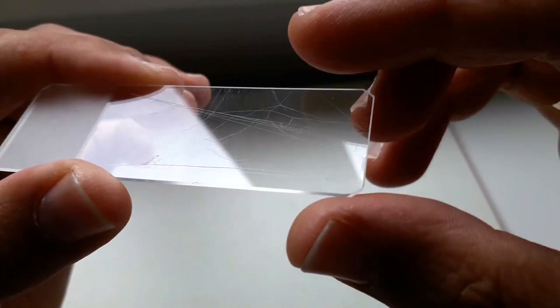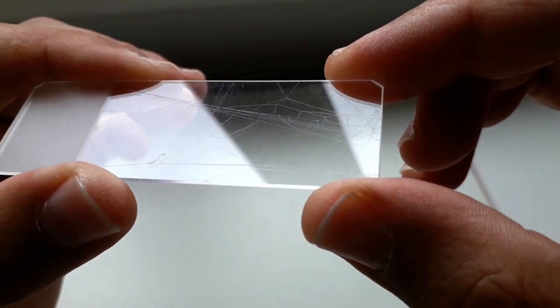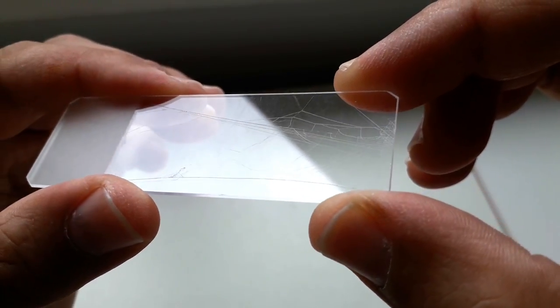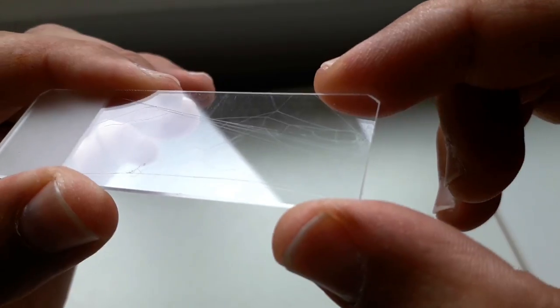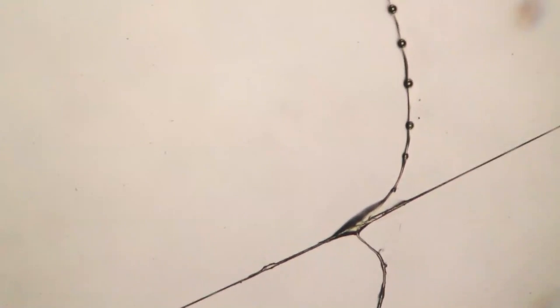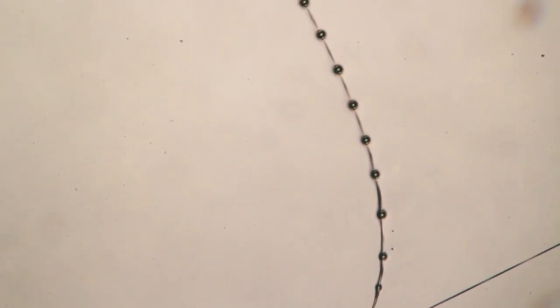Here on the microscope slide you can see many of these threads, the sticky threads that make up the spider's web. They're quite fine, and under the microscope they showed something quite interesting - basically some of them have those circular round beads on them. These seem to be glue droplets. Other threads do not have that and apparently they are not sticky.